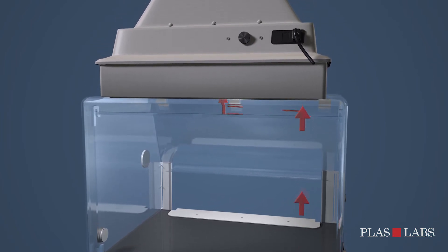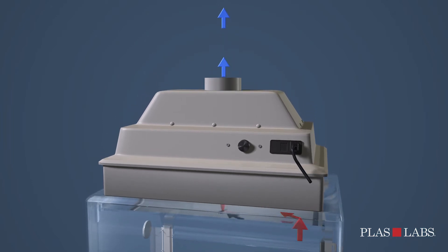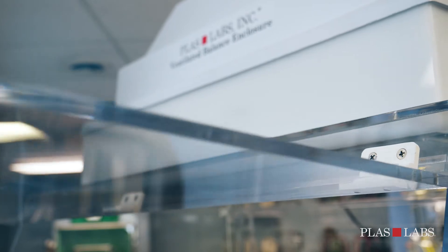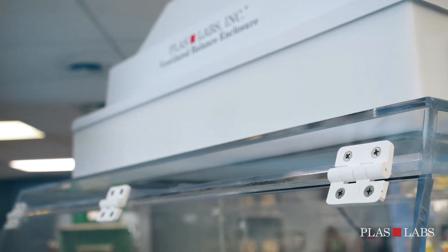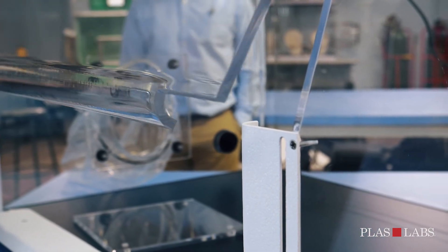The 6 inch OD exhaust port can be hard ducted, thimble connected, simply allow the filtered air back into the laboratory or exhaust it out of a mobile laboratory. The optically clear, 3/8 inch thick acrylic housing provides complete visibility inside the hood and smooth corners for easier airflow.